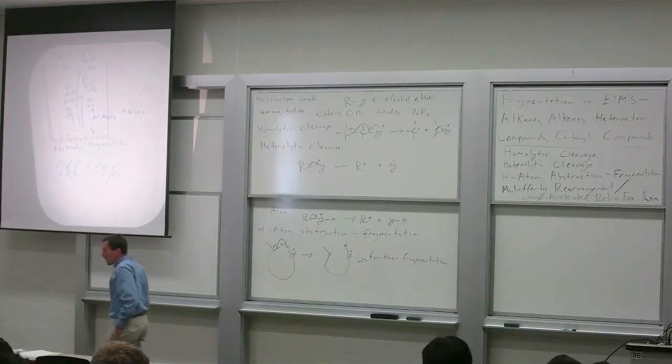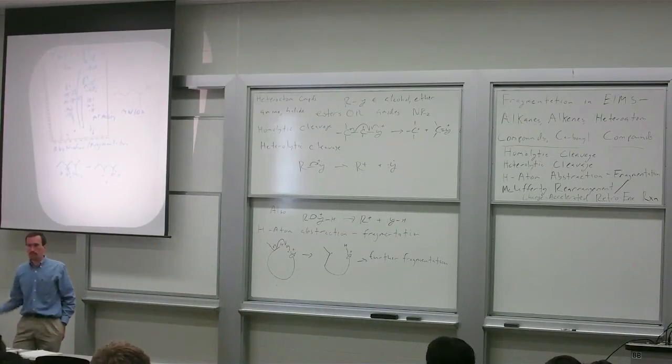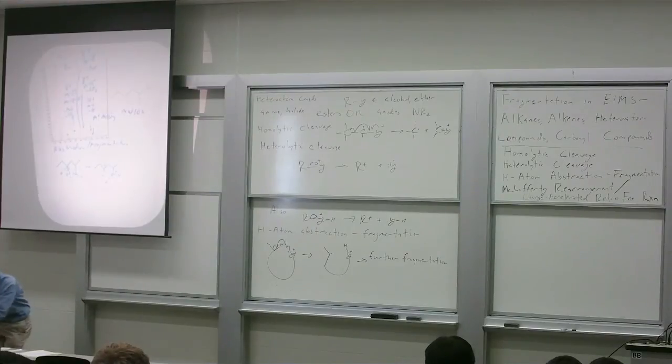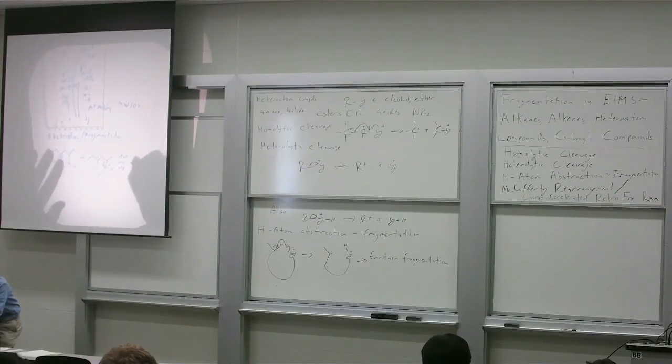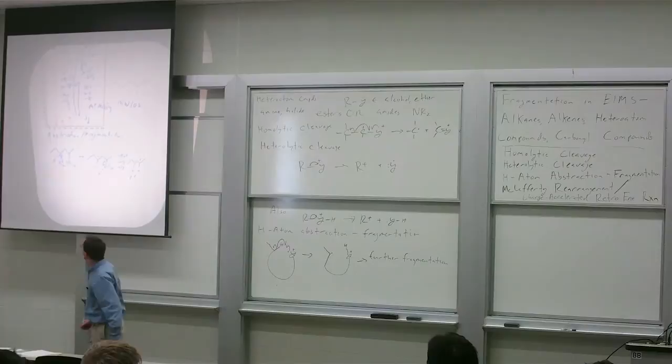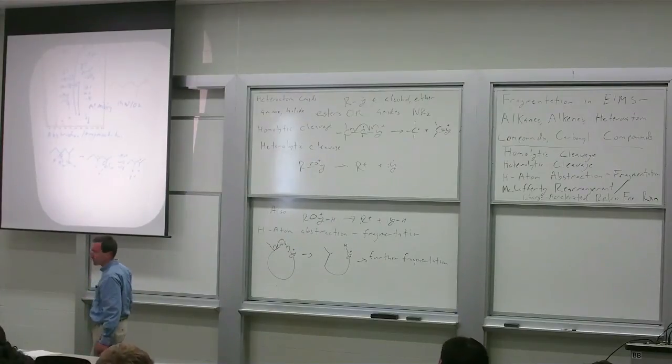Well, this sets us up with a leaving group, water, to leave. If water leaves, takes care of our minus 18 peak, that gives rise to a radical cation at, again, I'm going to draw out my structure very explicitly. That gives rise to a radical cation at 84. There's our 84 peak.